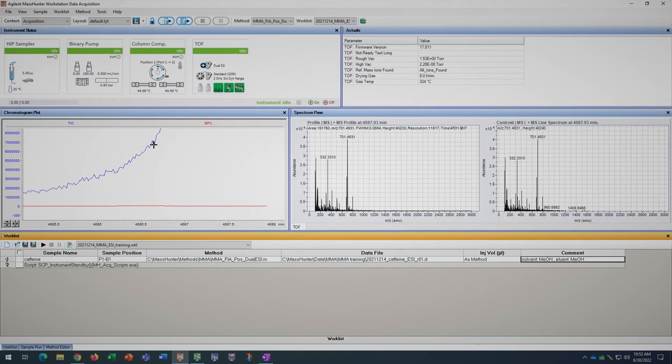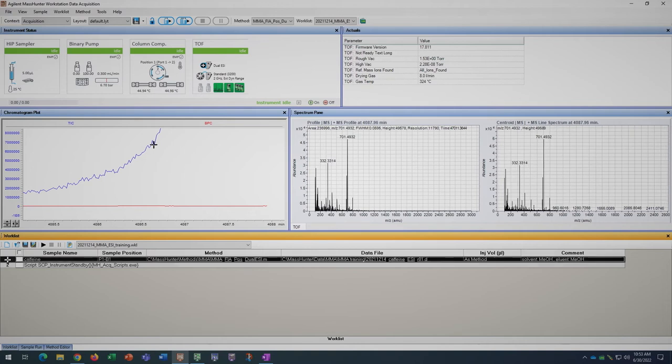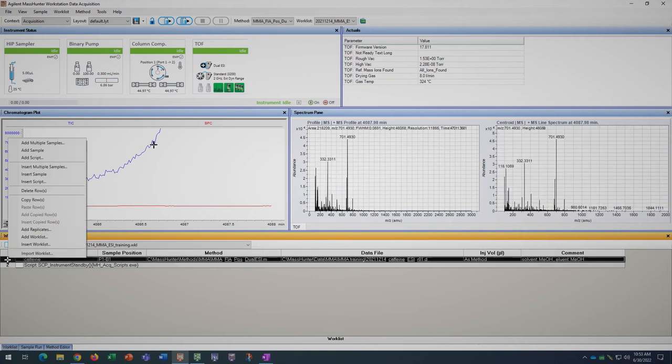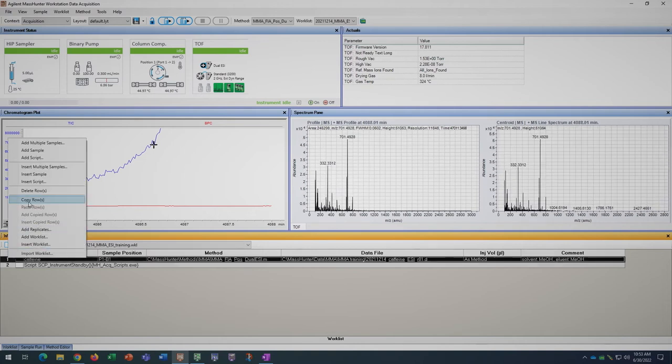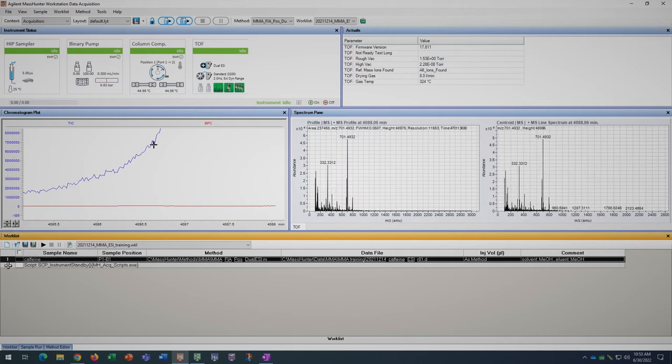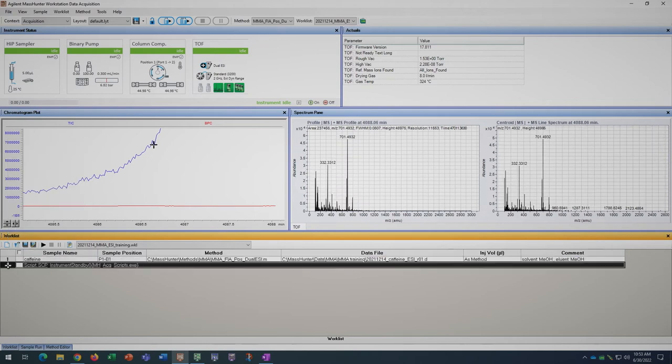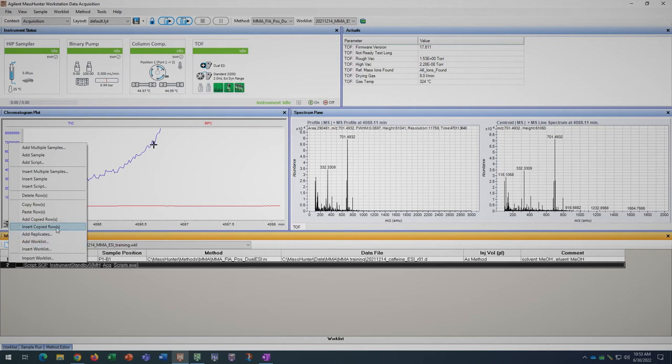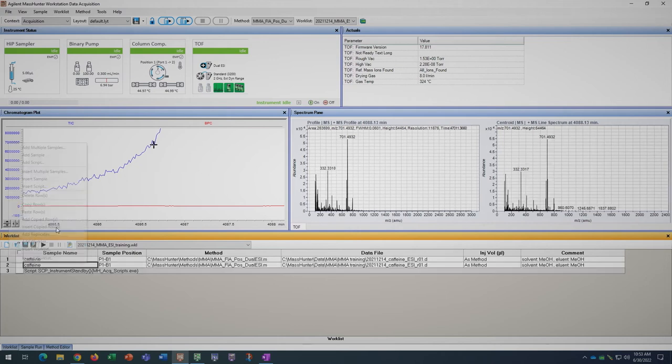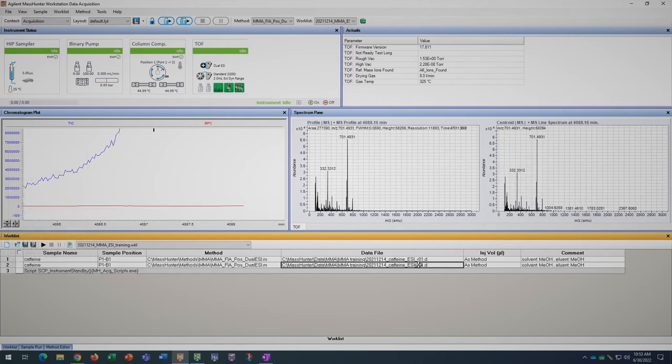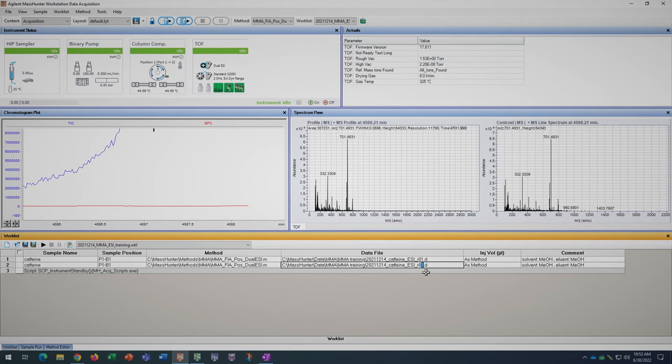To add more samples with the same parameters, select the row, right click, and select copy row. Then, select the row below which you would like to insert the next sample and select insert copied row. You can do this for multiple rows at a time, but make sure that the standby script is always last.